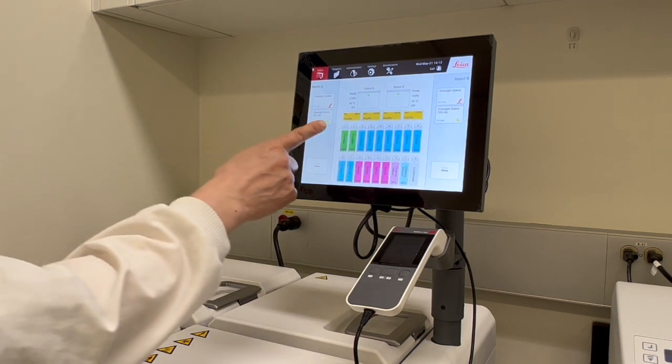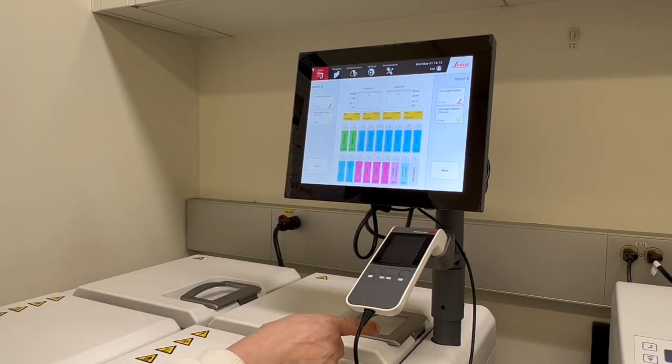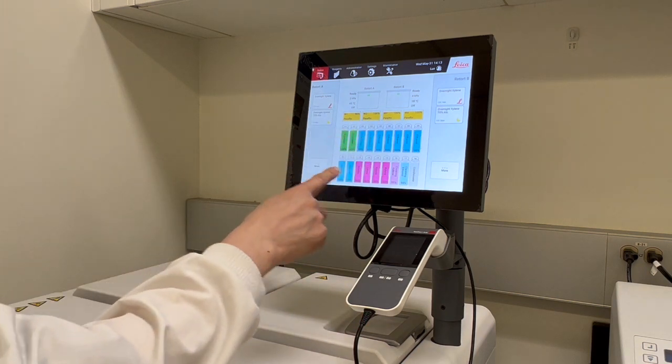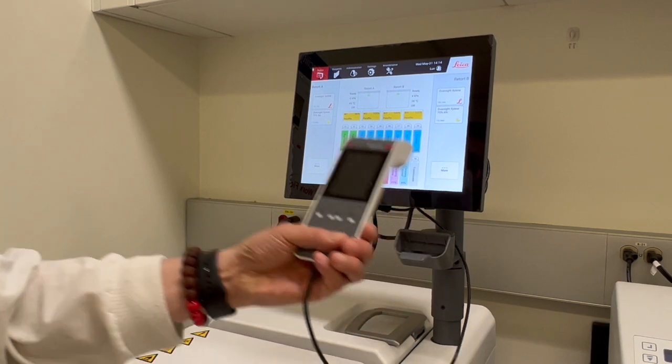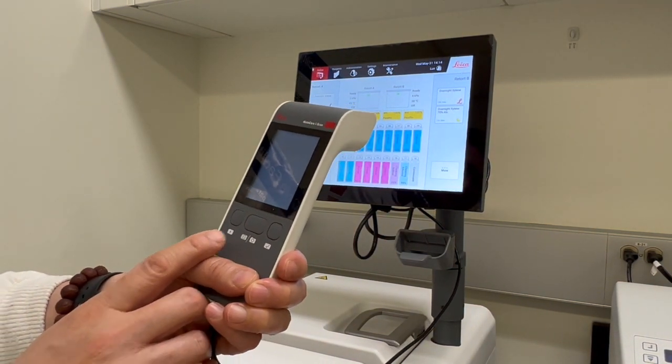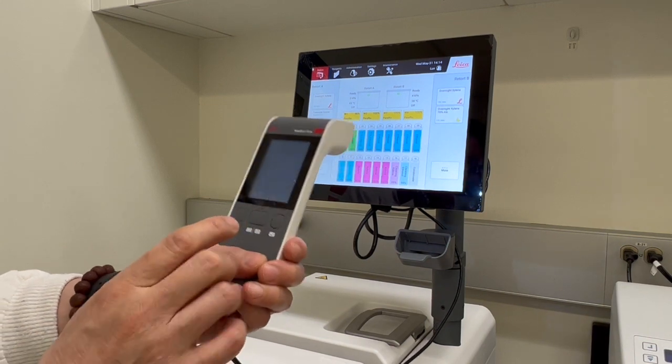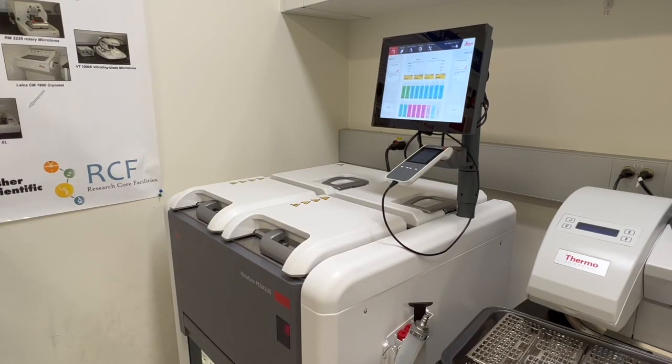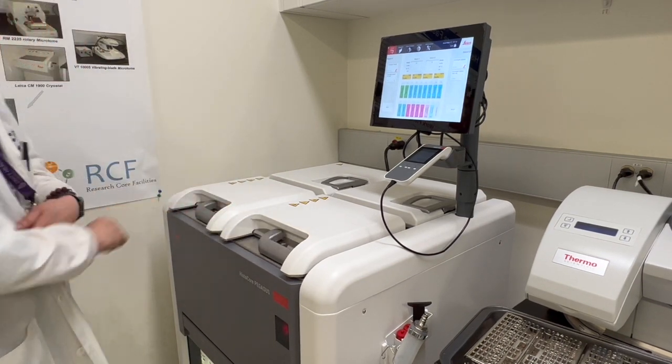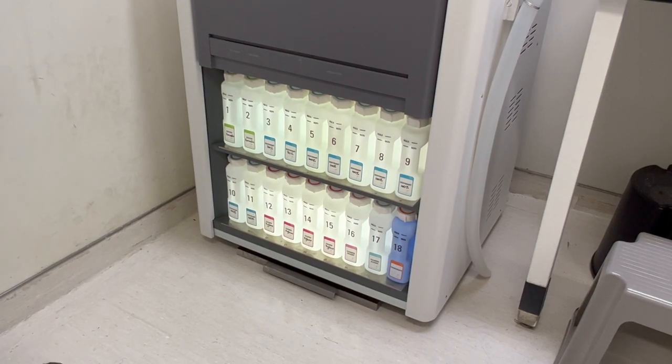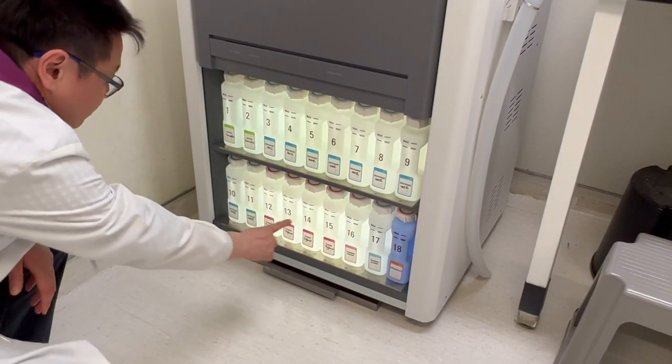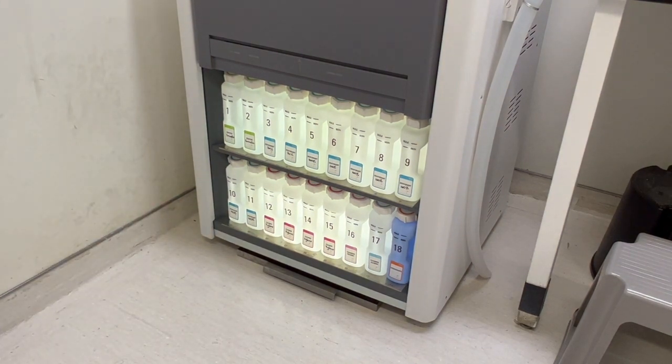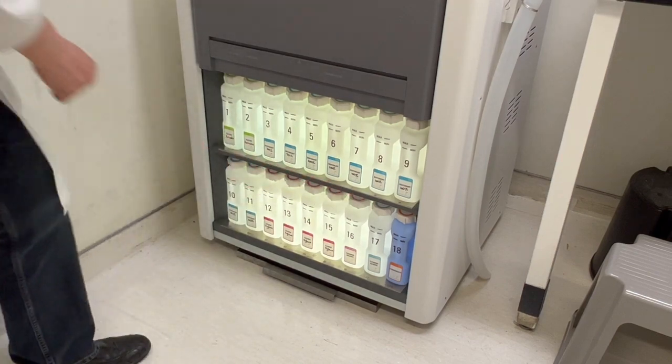This is the color touchscreen, which connects to a computer in the instrument. You can monitor, edit, and operate the processor here. This is the scanner, with which you can scan barcodes and take pictures. Here are the two retorts, where you will place your cassettes for processing. This is the reagent cabinet, which accommodates 17 reagent bottles and one condensate bottle.